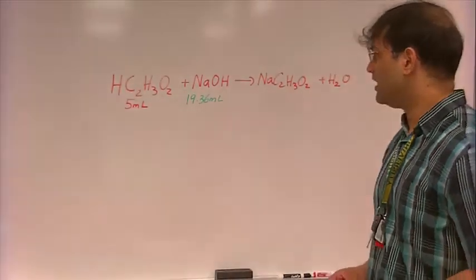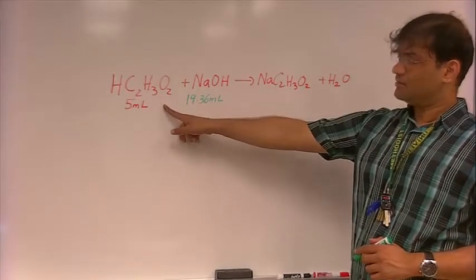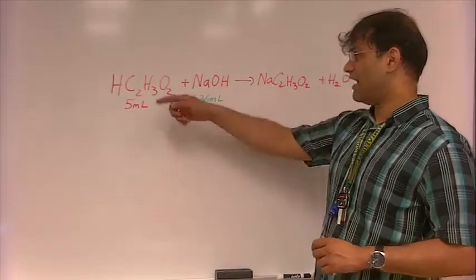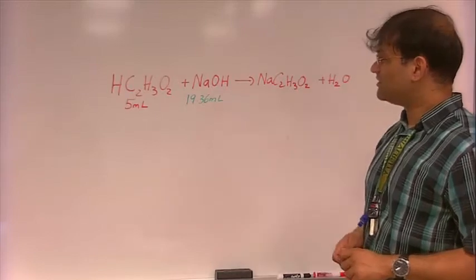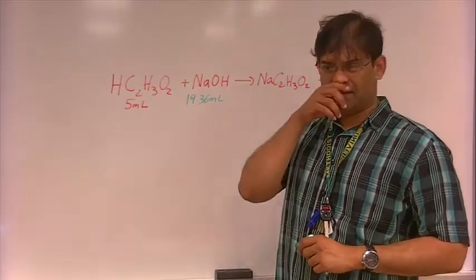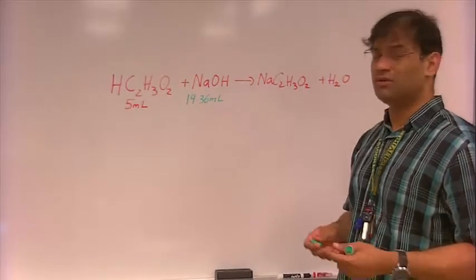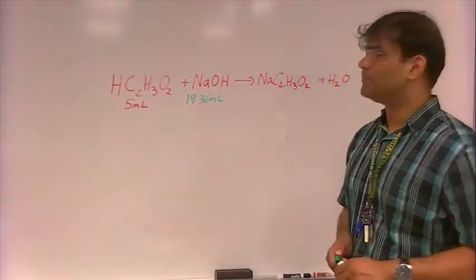So for our final volumetric analysis, we want to figure out how much acetic acid is actually in vinegar. So this is the formula for acetic acid that you found in vinegar. You put 5 mils of this vinegar. This 19.36 mils came from me averaging the two pH titrations. Okay, so when you do your pH titrations, you average them. When I did that, I got 19.36 mils. So your values may be a little bit more, a little bit less. Everyone is going to be different.